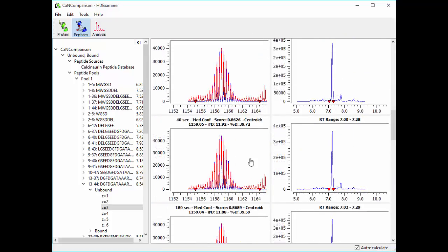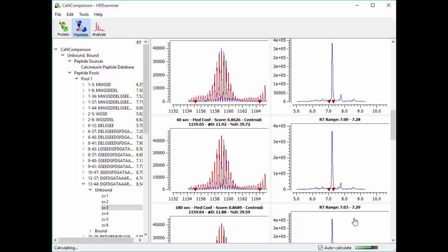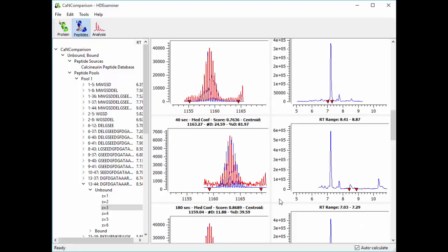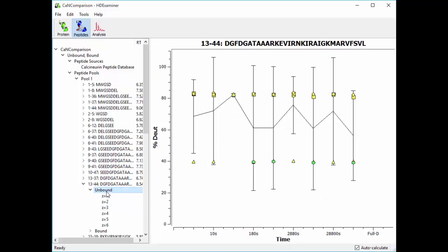So what we can do is right drag over the retention time range we want, and this tells HDExaminer to use that range instead of the range it previously calculated. And you can see that it found a medium confidence result, and if we look back at the unbound trace, we can see that for that time point, all of the results now agree.